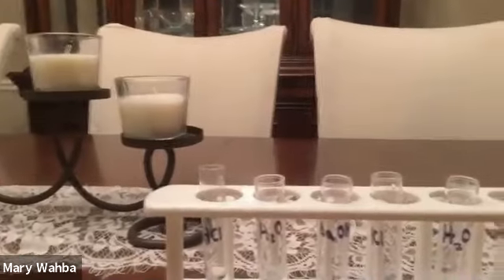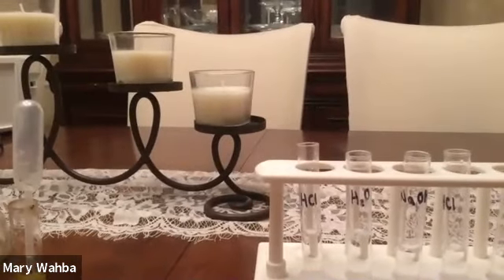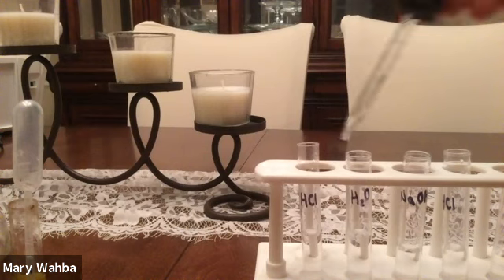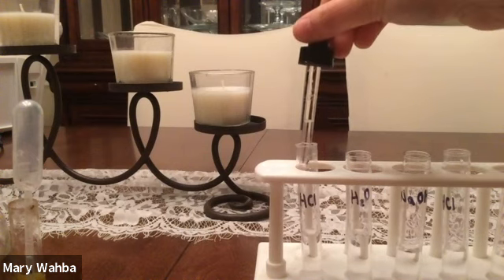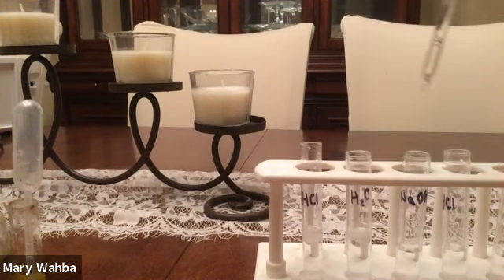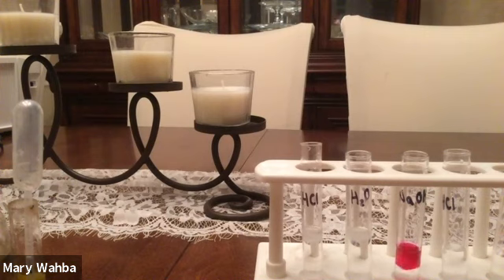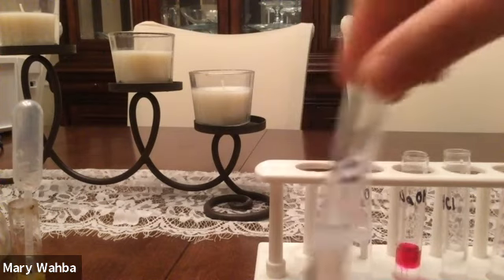So I'm going to go ahead and turn the camera right here. I'm going to add phenolphthalein, which is a clear colorless solution, to my acid here. I'll put a couple of drops in the acid, a couple of drops in water, and then a couple of drops in NaOH. And I'll mix them together so you can see it a little bit better.